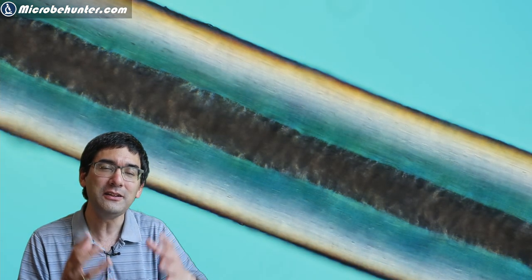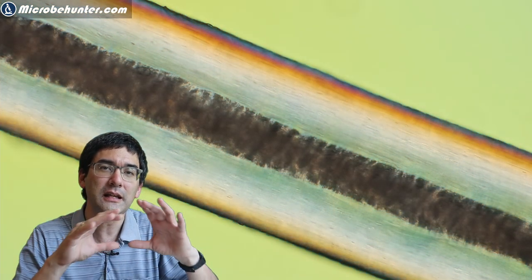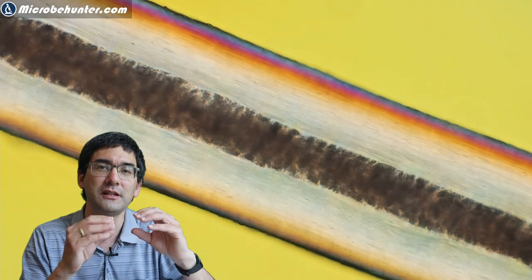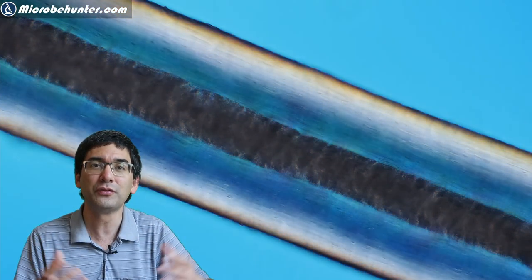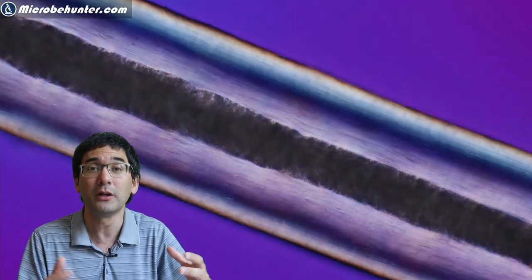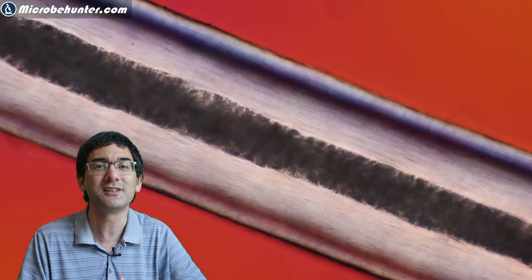If you look at the hair inside, you can see that the hair is actually made of different layers. There is a darker central region and a brighter periphery. The central region is known as the medulla of the hair, and the periphery is the cortex.